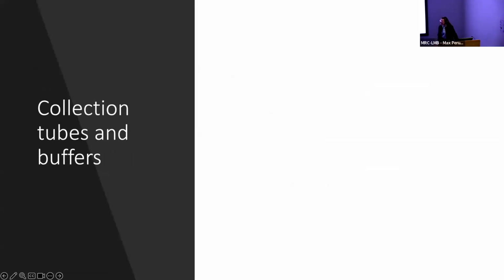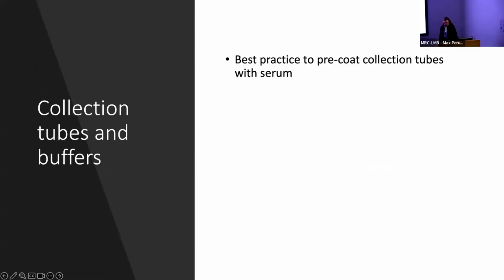All right, a little bit about the collection tubes and some of the buffers that we recommend. The first is that it's best practice to pre-coat collection tubes with serum. One of the reasons we recommend this is that when we're calibrating the sorters, we calibrate the location where the side streams that are generated hit inside the collection buffers. We aim to have those side streams hit the exact center of the collection tube.